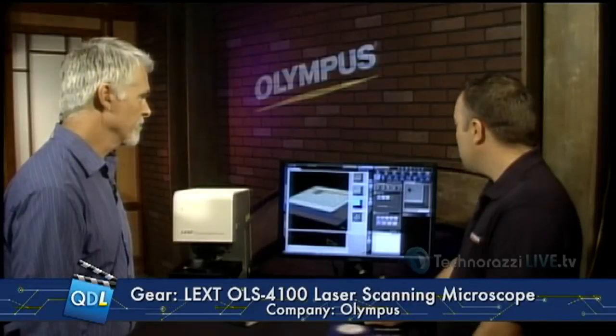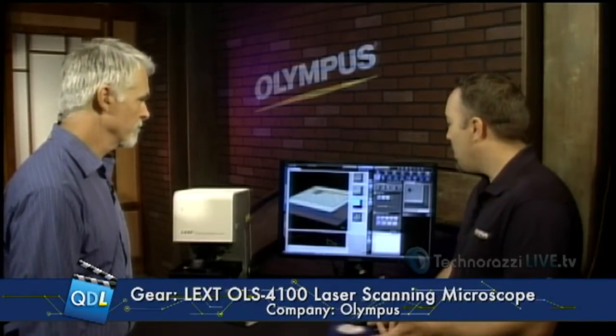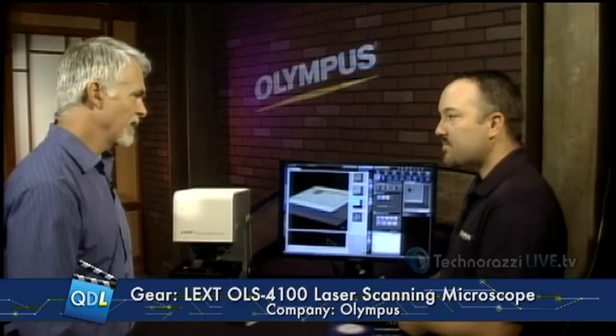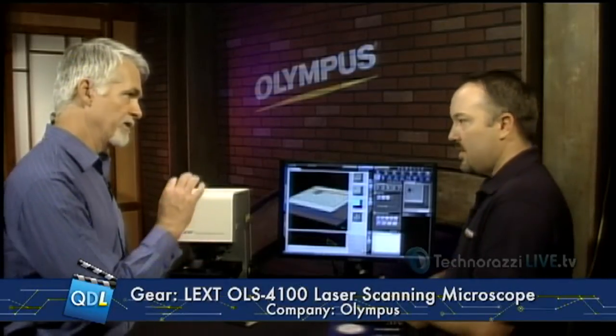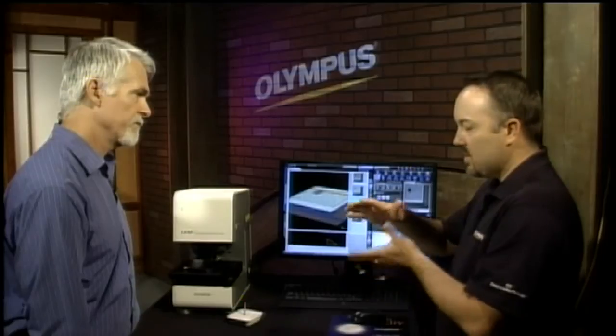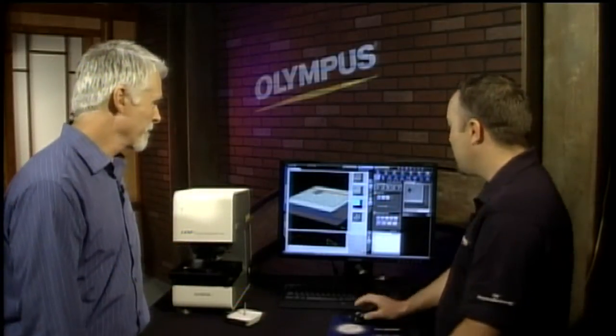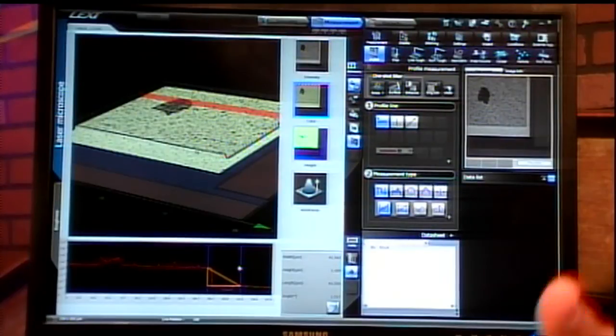We have particle analysis measurement, and the tool is also capable of doing film thickness measurements for transparent optical films. For transparent films, you could determine where the top of the film is. The tool with the new multi-layer function will actually scan through and display both layers independently — the optical layer and the solid layer below, maybe a metal surface or something. And if you know the refractive value and put that in, it tells you the thickness without having to cut the sample. So you'd see the thickness between two layers on the graph.